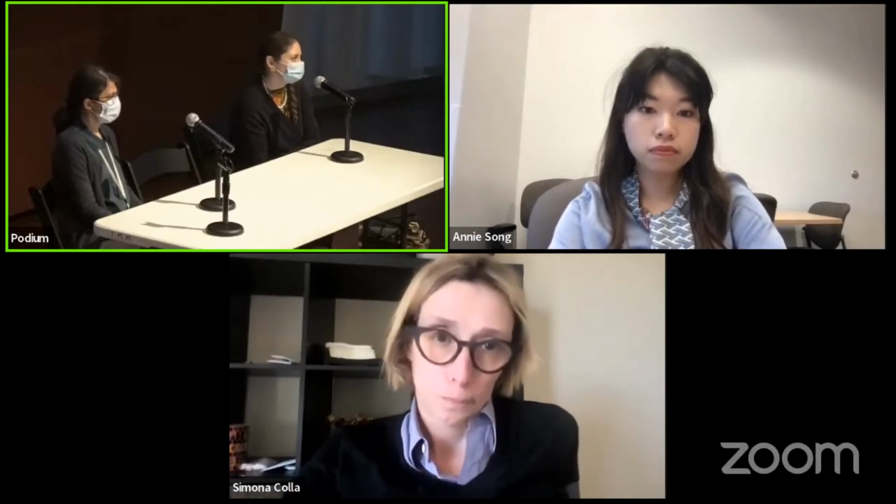Anyone else want to comment? No, I totally agree with her. I mean, it's fundamental, as I said before, to sort a live cell. Alternatively, you will lose money sorting something that is not going to give you high quality data, because you will find a cluster full of mitochondrial genes and you need to discard them.